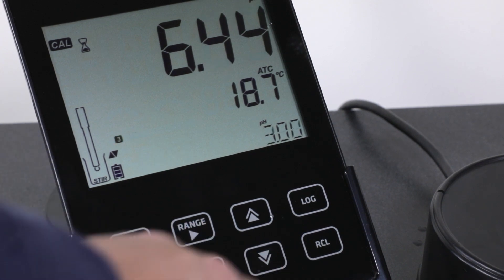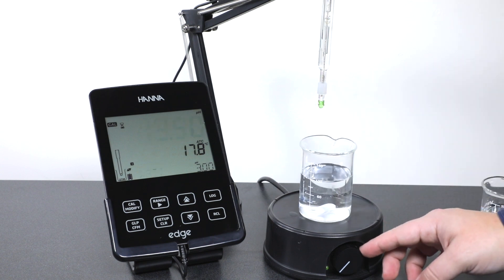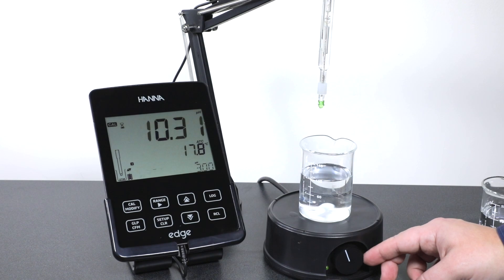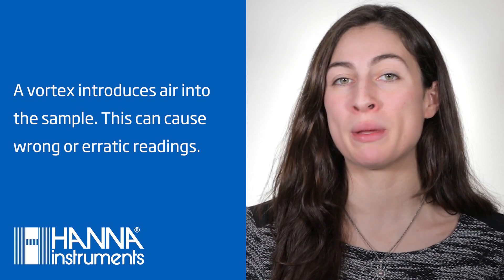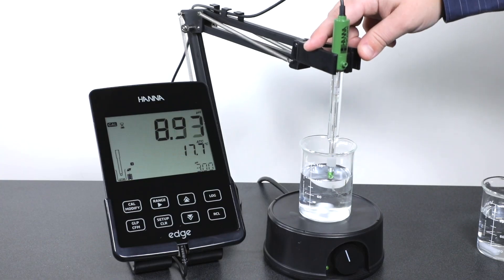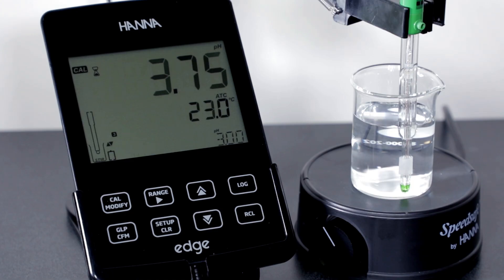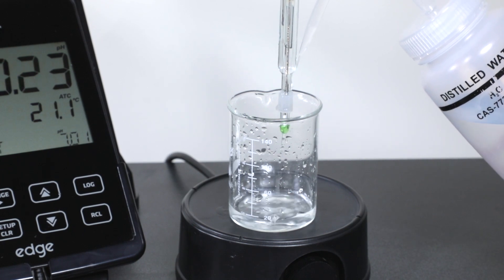For time, it will go to 6.86, then 3. Once you've set the meter to read pH 3 buffer, place your beaker onto the magnetic stirrer and turn the stirrer on. Make sure there is no vortex being formed inside the beaker — a vortex means the stirrer is spinning too fast and can alter your readings by introducing air into the sample. Once the buffer is stirring, place the electrode inside the beaker and wait for a stable reading. Once stable, press confirm and the meter will ask you for the next buffer, pH 7.01. Turn the stirrer off and place your empty beaker under the electrode to rinse with distilled water to prevent any cross-contamination from your buffers.